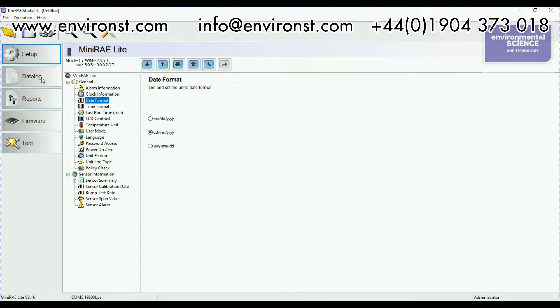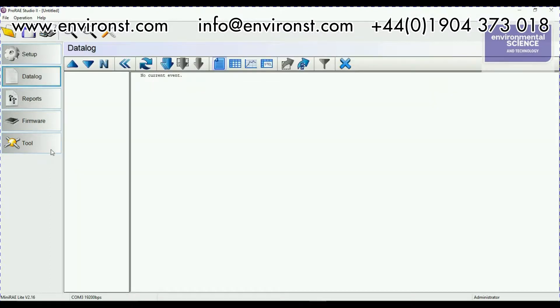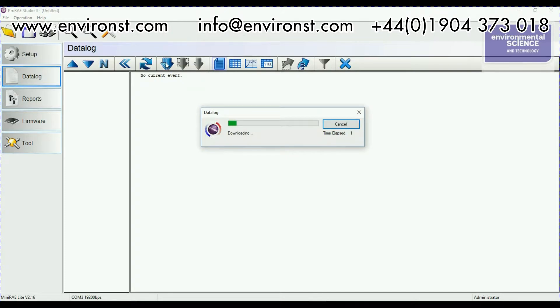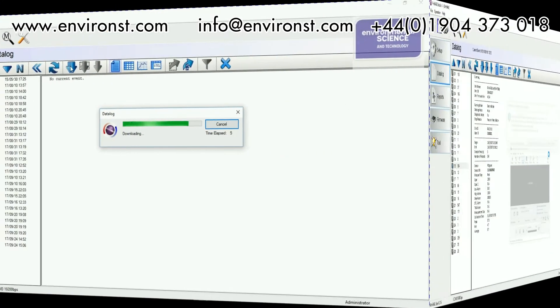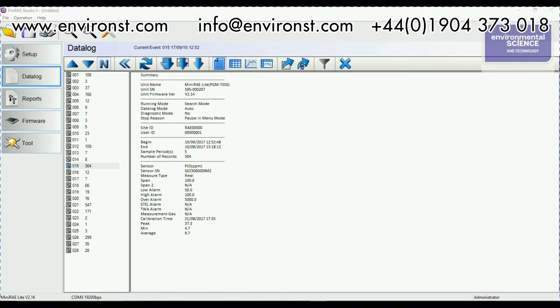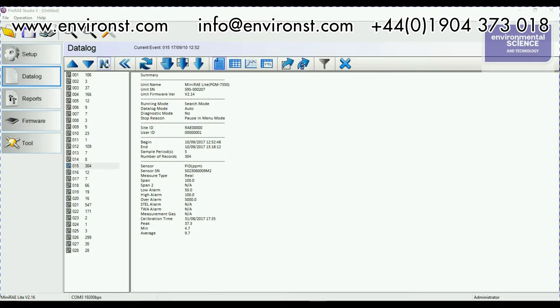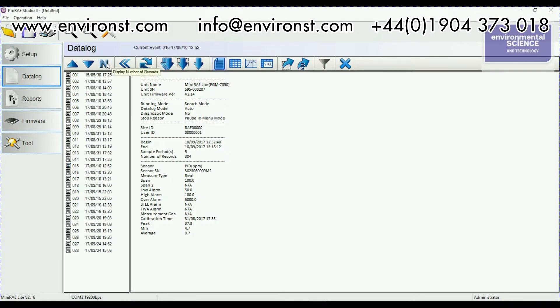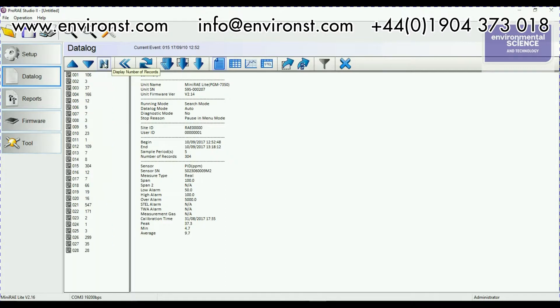If I go to data log, if I hit this arrow here that will download all the data log from the instrument. So that took a little while to download. Now what I suggest you do here is rather than have it in this display if you want to have a look at what's recorded the most data you just hit this end button and you get your data points come through. So this one here 304 data points.